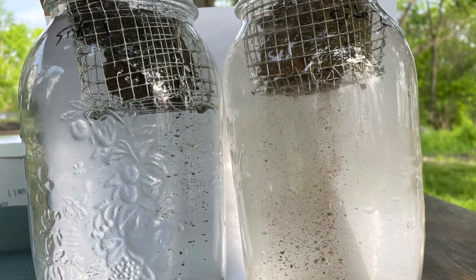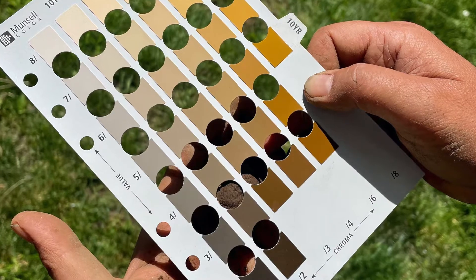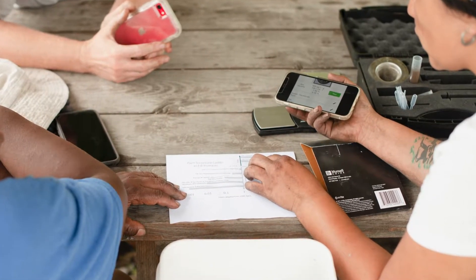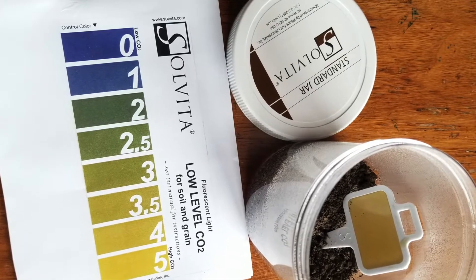This video showcases the Munsell soil color test, the microbiometer field test, the Solvita soil respiration test, and the soil hardness test.